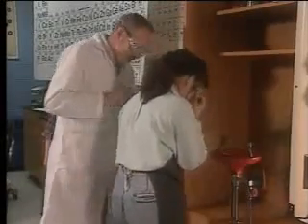If a chemical hits your eyes, wash them immediately in an eye wash fountain. Hold your eyes open and roll them around so the water can wash them thoroughly. You shouldn't be wearing contacts, but if you are, get them out as soon as you've given your eyes a good initial rinsing. Continue washing for at least 15 minutes. Then see a doctor immediately to check your eyes for damage.